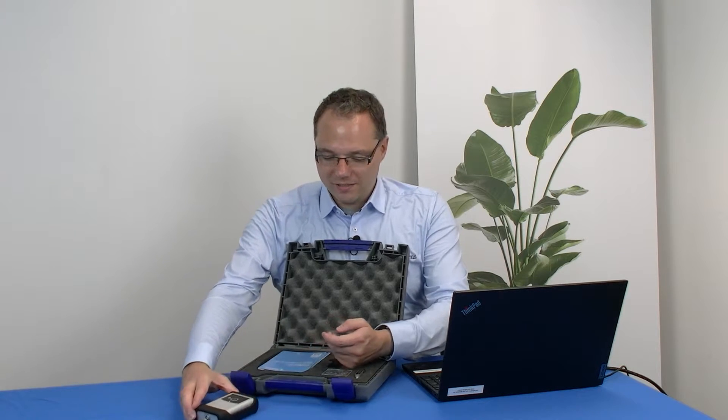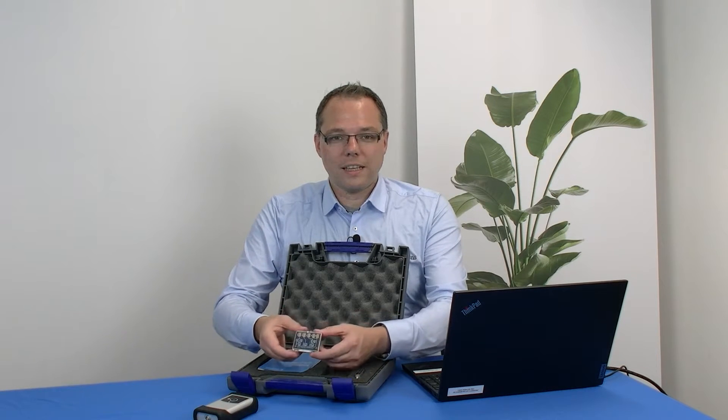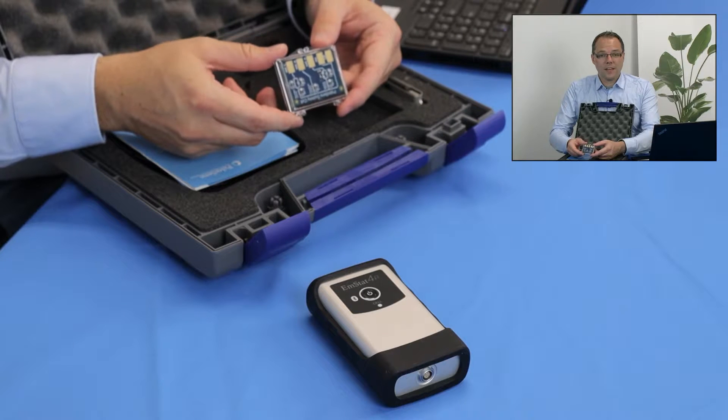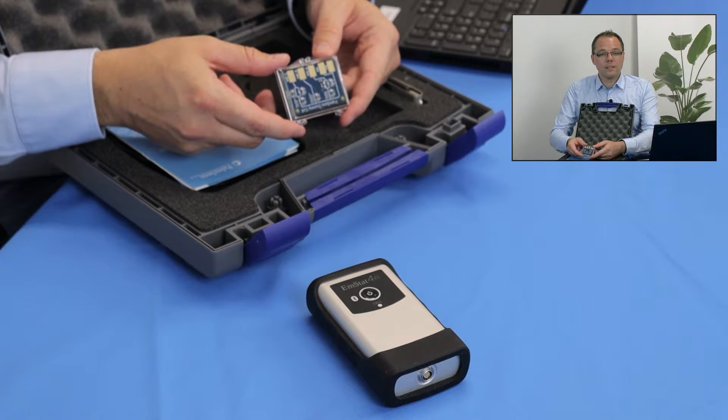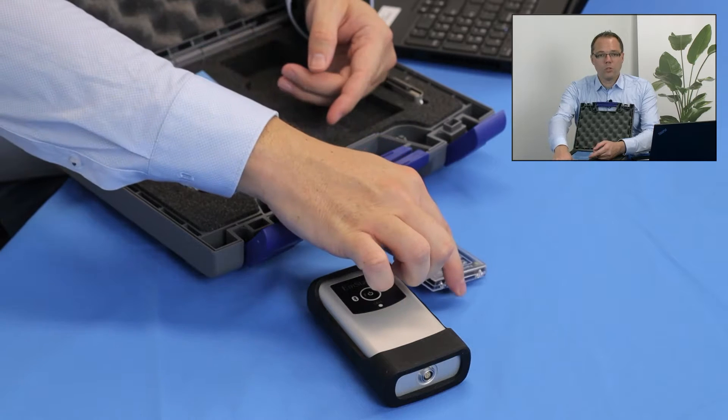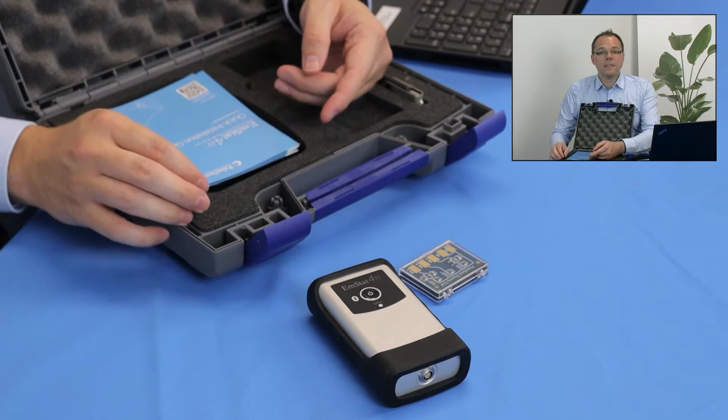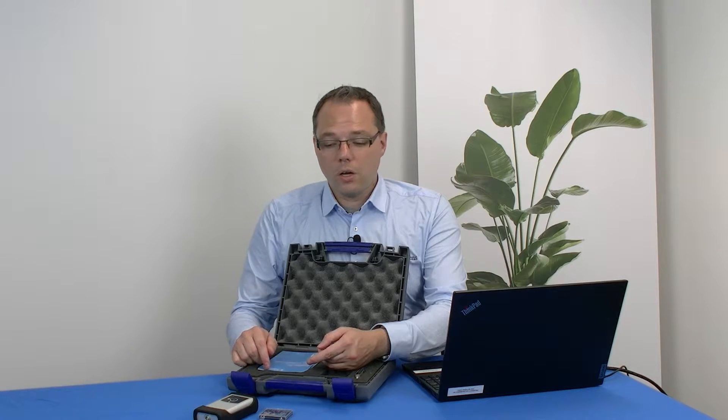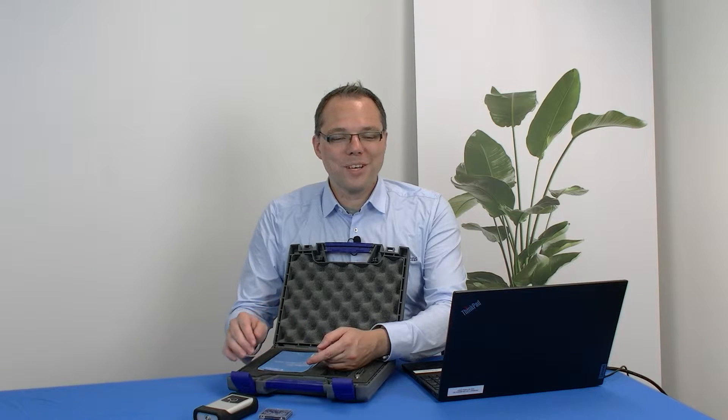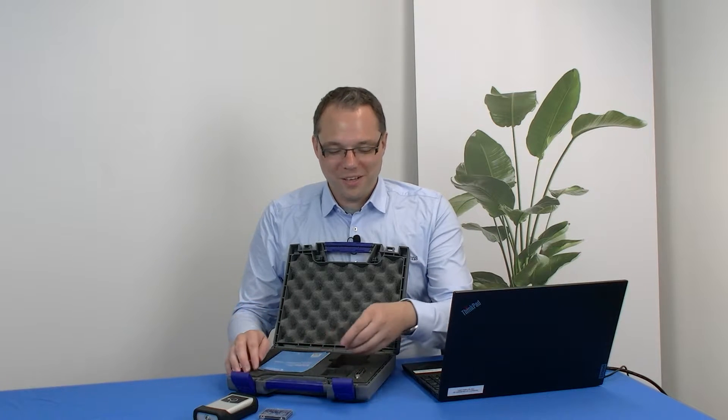So we start with this one. We also find in there a dummy cell that has some simple circuits in there that's very handy if you want to do some test measurements. And this is also what we will do today. We will do a measurement with the dummy cell, so stay tuned for that.